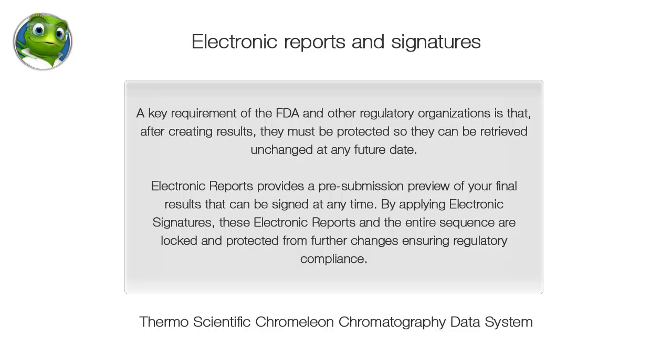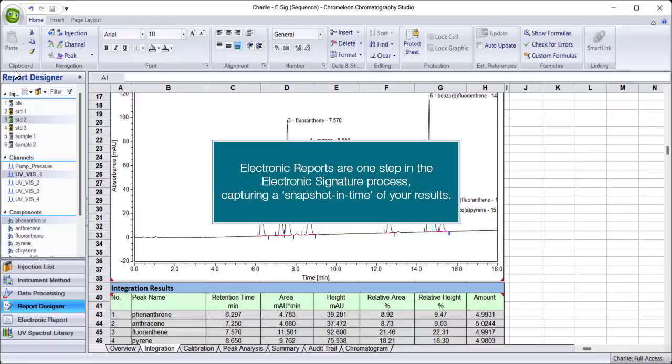A key requirement of the FDA and other regulatory organizations is that, after creating results, they must be protected so they can be retrieved unchanged at any future date. Electronic reports provides a pre-submission preview of your final results that can be signed at any time. By applying electronic signatures, these electronic reports and the entire sequence are locked and protected from further changes, ensuring regulatory compliance. Electronic reports are one step in the electronic signature process, capturing a snapshot in time of your results.